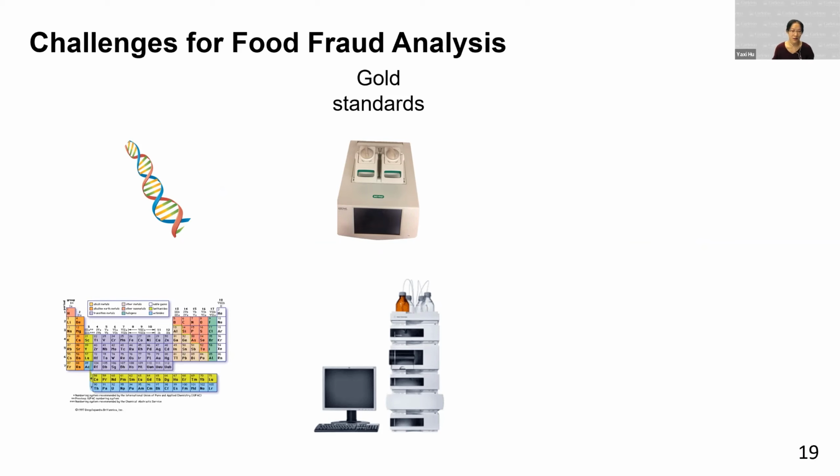I think after these several years of pandemic, a lot of you have at least heard many times about this PCR technology. It is a technique to amplify the DNA or RNA in the biological species, and then combine it with a result visualization method. You will be able to see which biological species is present in your sample.